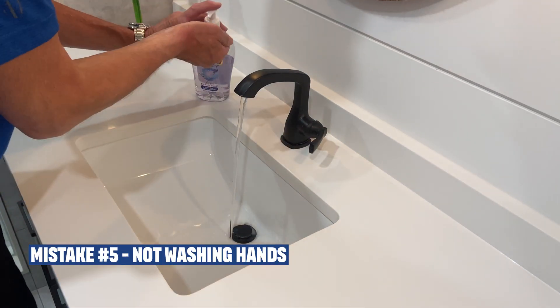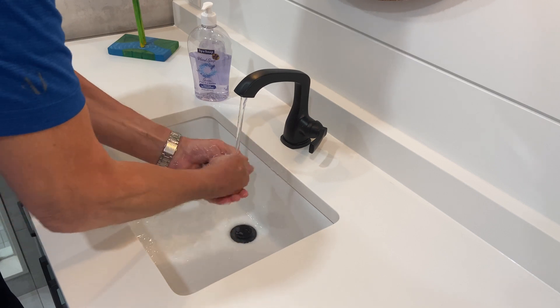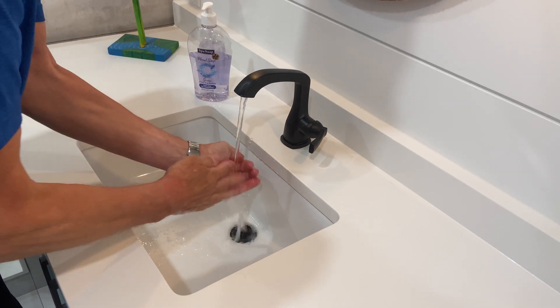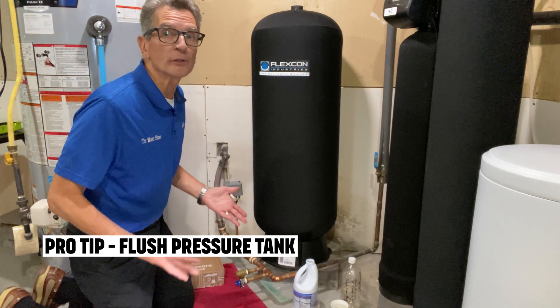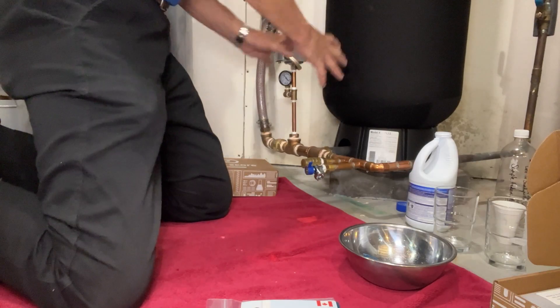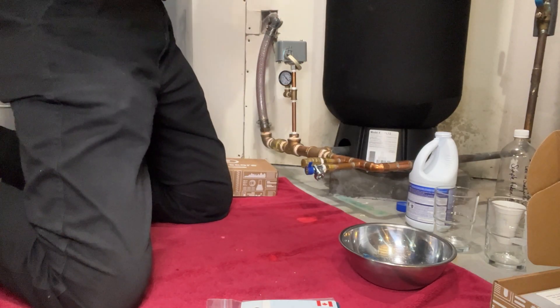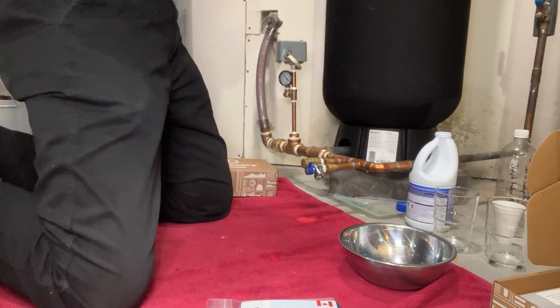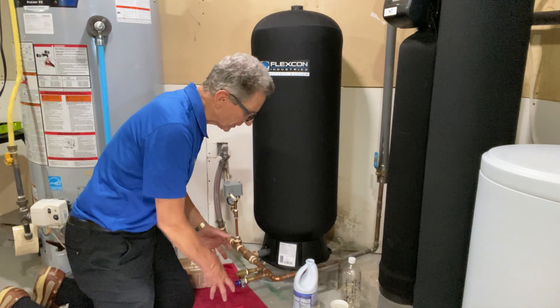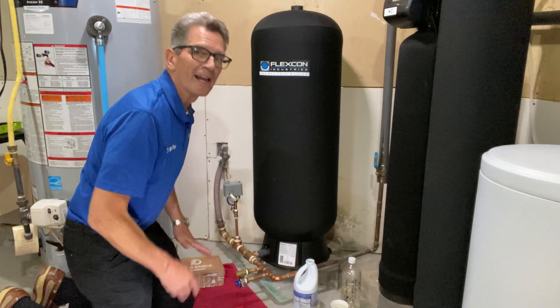Mistake number five is not washing your hands properly with soap. You want to make sure there's nothing on your hands that would introduce bacteria into the water samples, which would of course affect the results. Here's a pro tip when you're doing the water sampling: make sure you flush out the pressure tank ahead of time. Dirt settles in the bottom of the pressure tank, so hook up a hose to the hose bib at the bottom, flush all that out before you start sampling, and you're good to go.